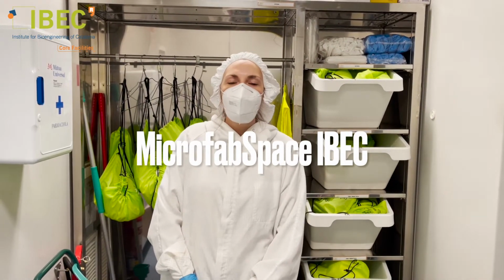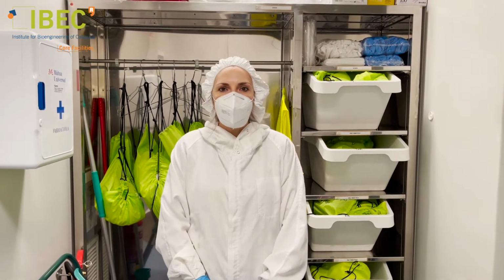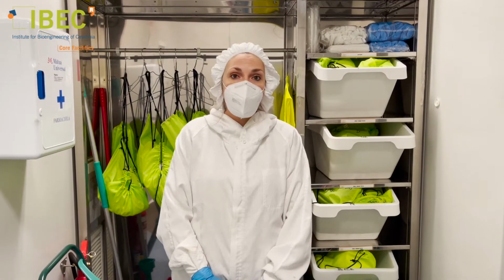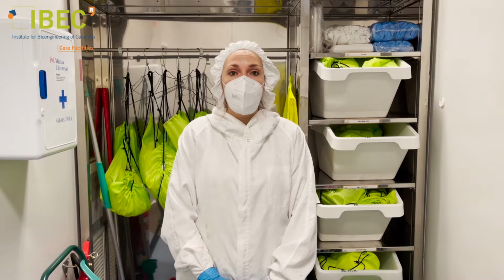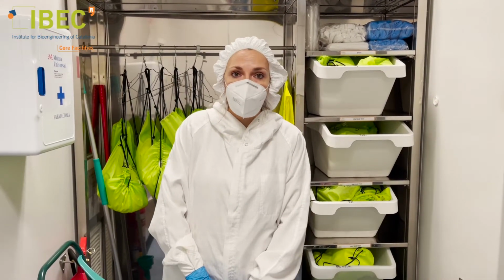Welcome everyone to the microfab space of IBEC. This is a core infrastructure of IBEC, and is where our researchers, but also external ones and companies, come to fabricate biomedical devices of all kinds.